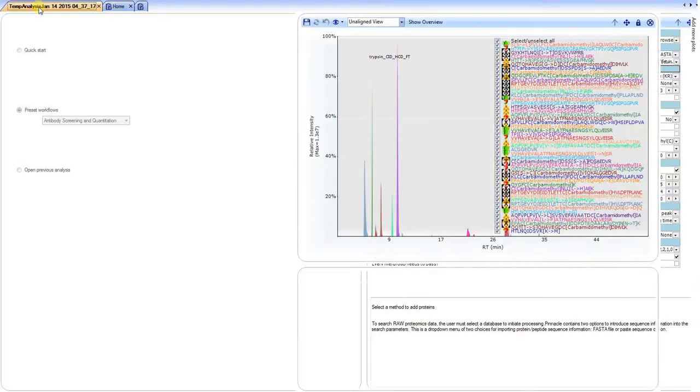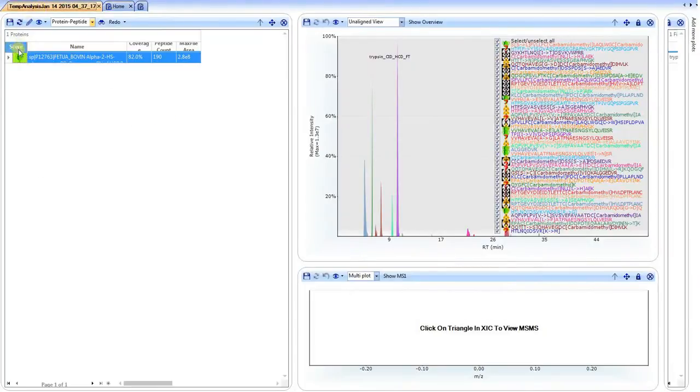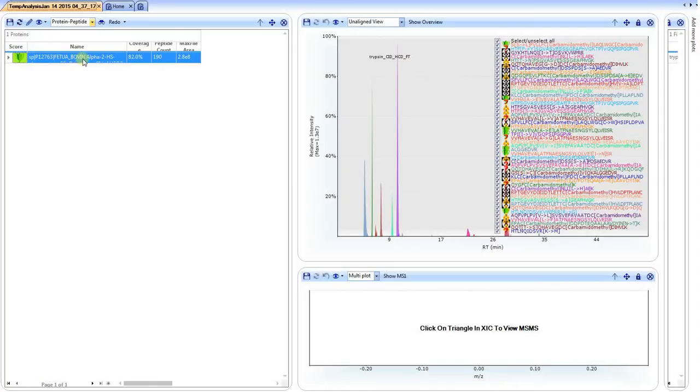Once the data is completed, this is what the review would look like. If we click on the protein itself, again bovine fetuin, we have the view of the table on the left, the chromatographic view showing all possible peptides, as well as the index.